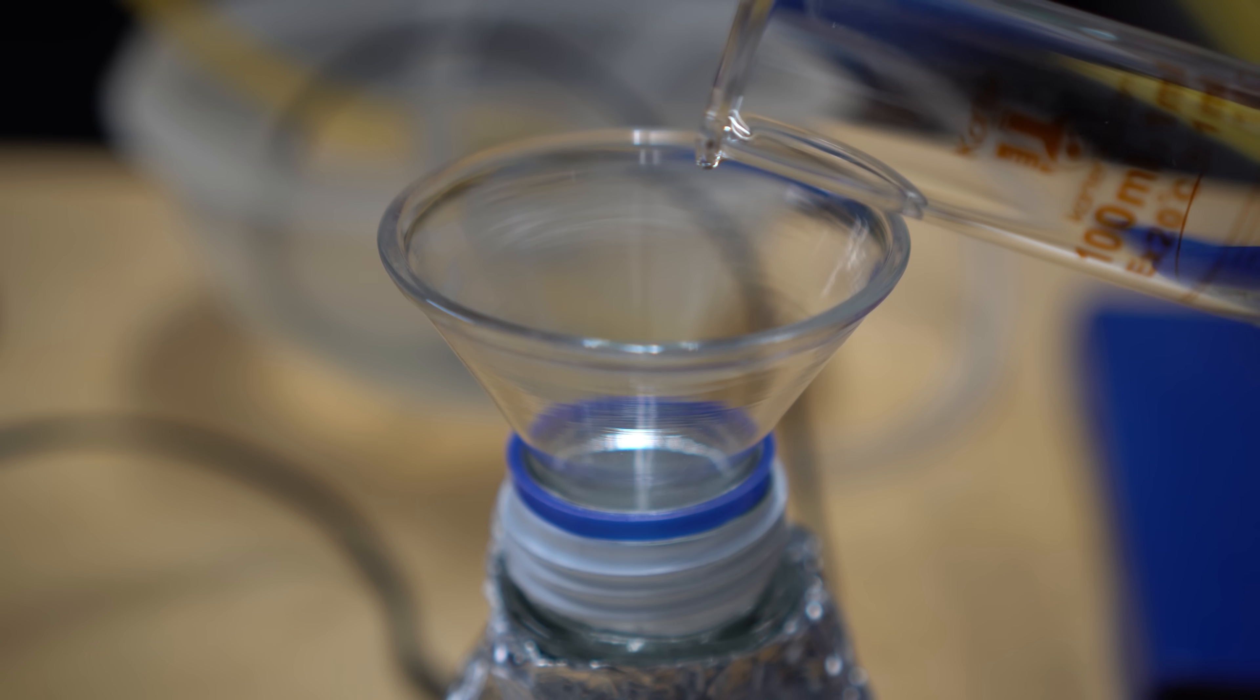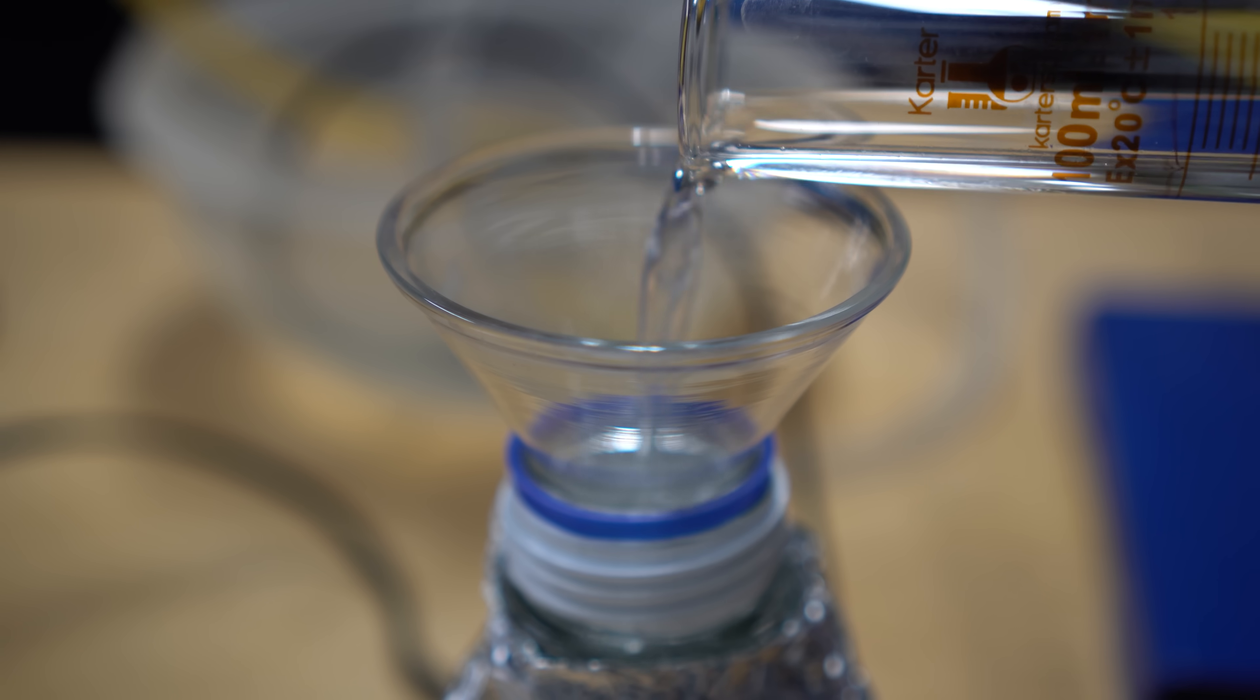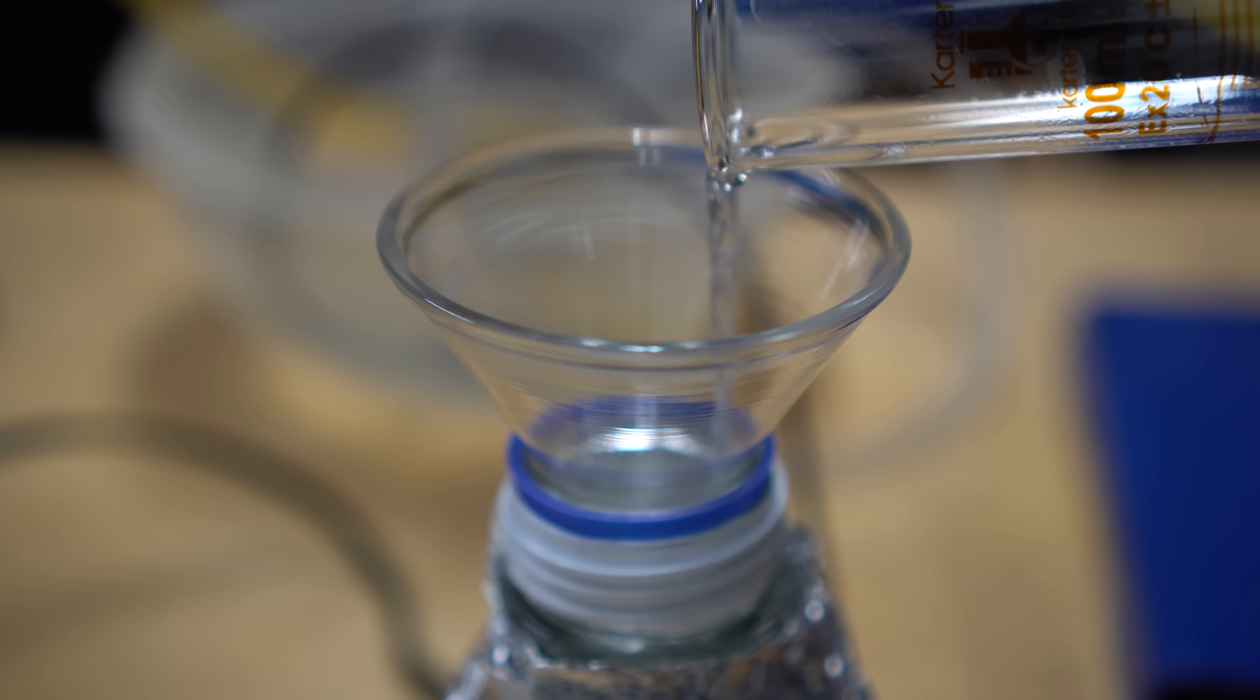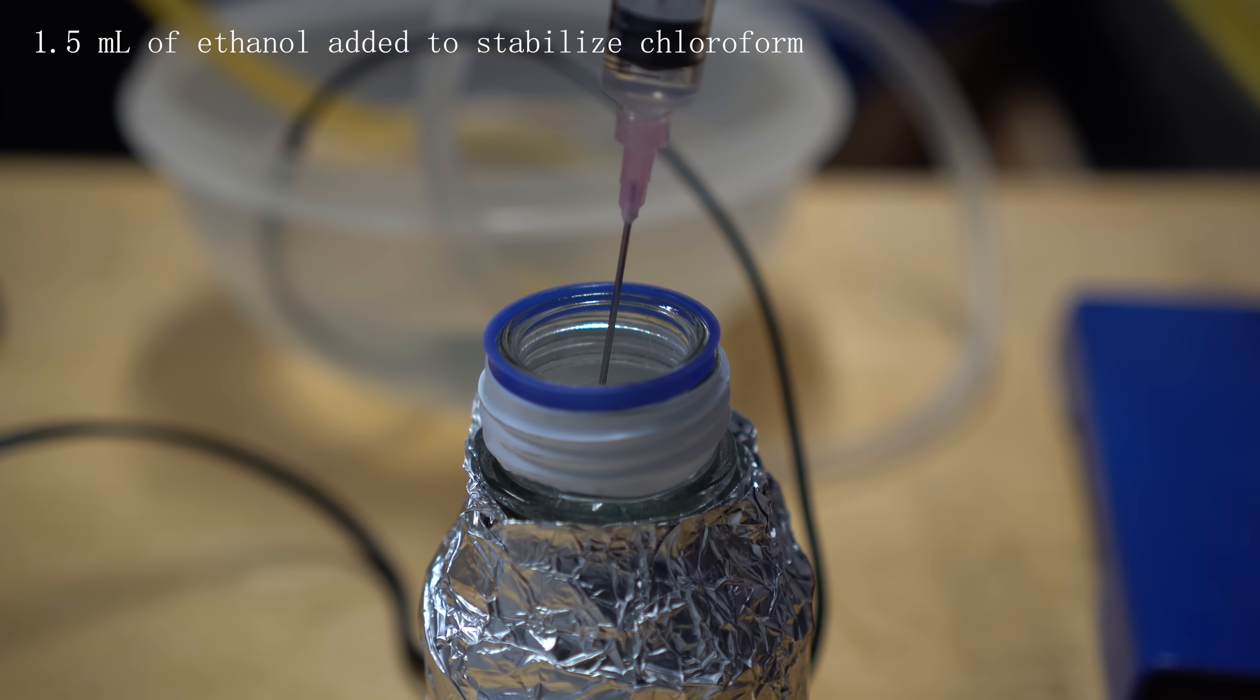Everything was poured into a glass bottle with aluminum foil wrapped around the bottle. This is because we don't want any UV light because phosgene production can happen as chloroform degrades. 1.5 milliliters of absolute ethanol was added to the chloroform to prevent the formation of phosgene. I mean, it was just used in World War I as a biochemical weapon, but who am I to judge?